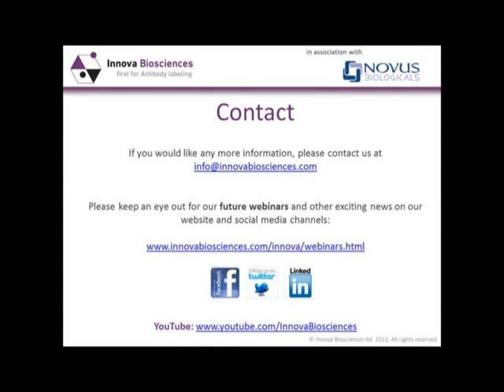The main advantage is that direct labeling is a much cleaner technique, and you can get results at least as good with direct labeling as you can with secondary reagents. Again, on the Innova website, there are some examples comparing direct and indirect antibody labeling, which show just that.